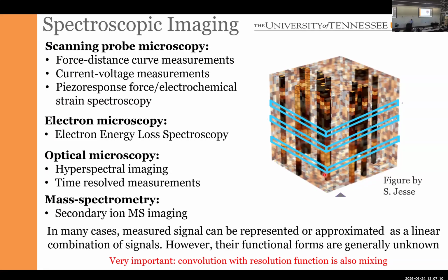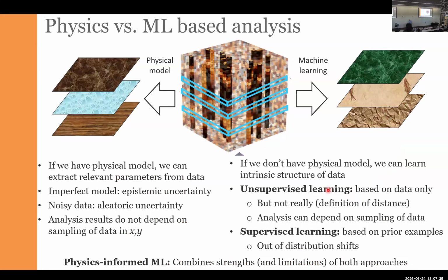Notice that the diffraction pattern you get in 4D STEM at each point on the image is technically also the same thing, except that at each point you have not a one-dimensional spectrum, but a two-dimensional spectrum. So overall, this structure, the XY plane in which you do sampling, typically on a rectangular grid, and then at each point you measure some spectral data set, is absolutely common for most imaging methods, whether it is STEM, SPM, and so on and so forth.